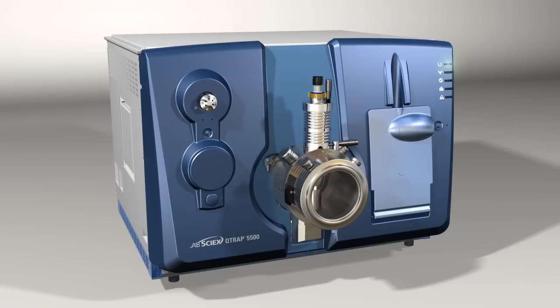With the QTRAP 5500 system, it's time to uncover a new order in quantitation.